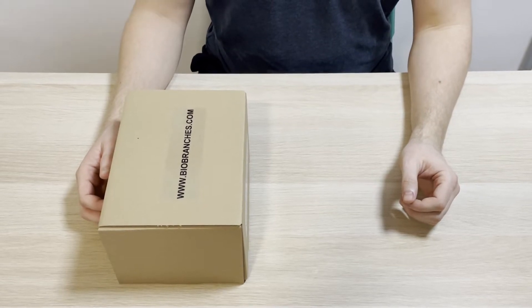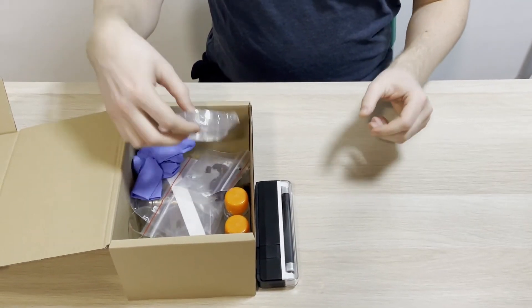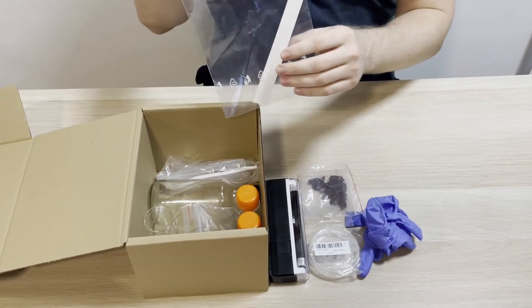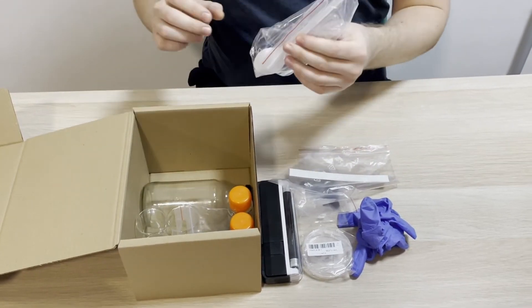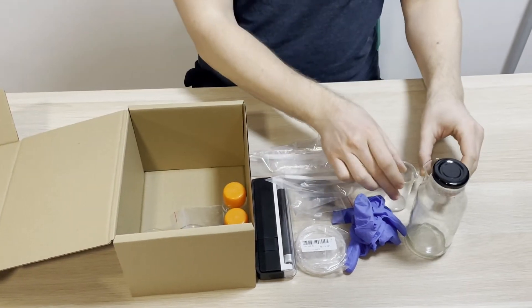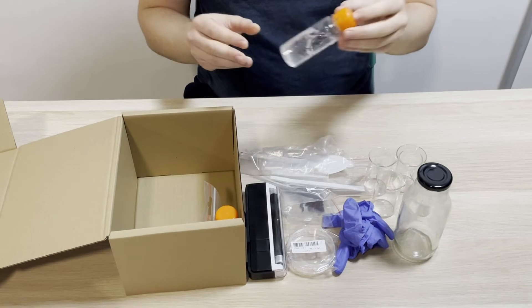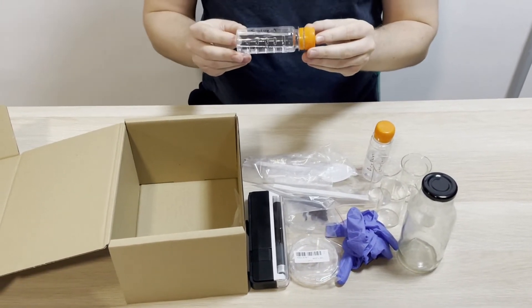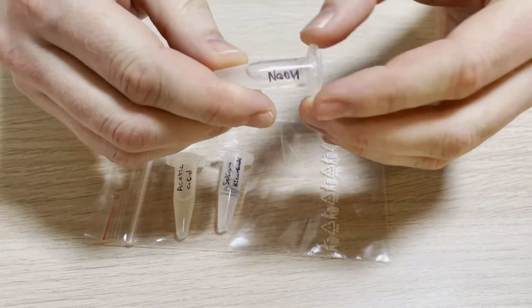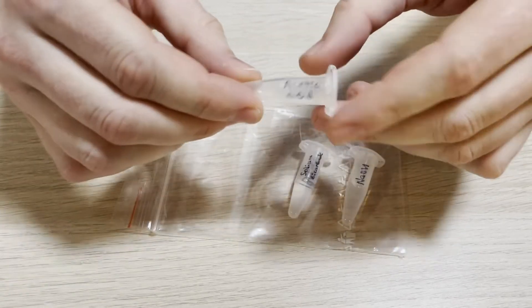Let's take a look inside the bio-branches box, which contains UV light, petri dish, hibiscus tea, gloves, chromatography paper, spoons and plastic pipettes, bottle, beakers, mixture of acetone and alcohol, solvent for camera, and other reagents: sodium hydroxide, sodium bicarbonate – also known as baking soda – and acetic acid, also known as vinegar.